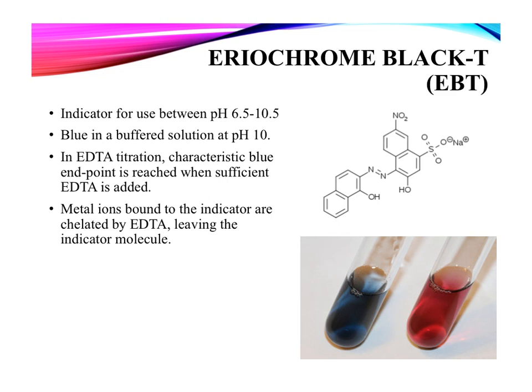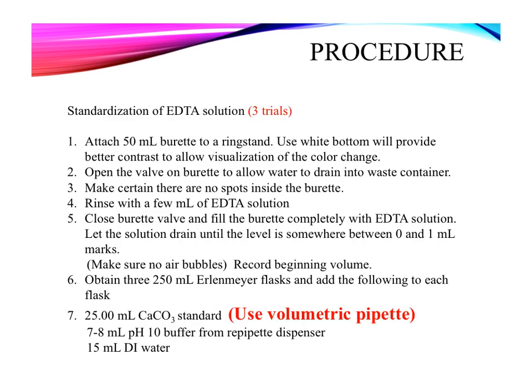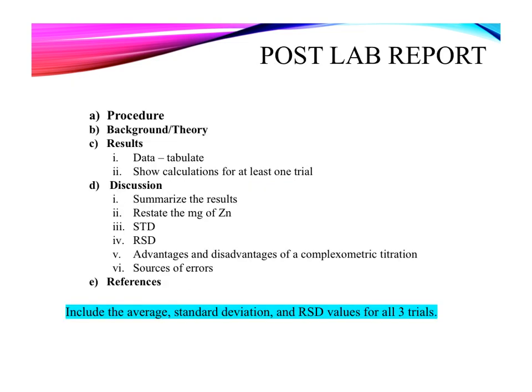Eriochrome Black T is the indicator that we will be using for this experiment. Please pause the video and take notes on this slide. Please pause the video and take notes on this slide as well, and on each of the next slides, including this final slide.